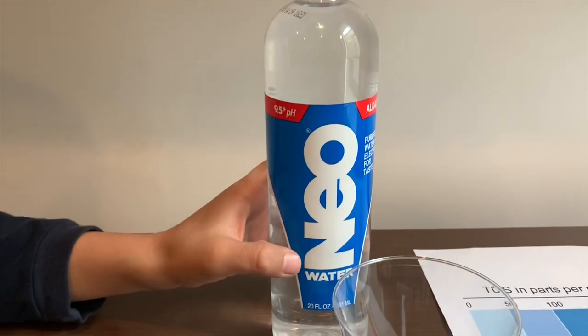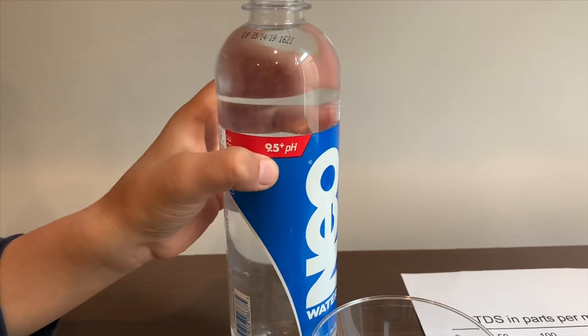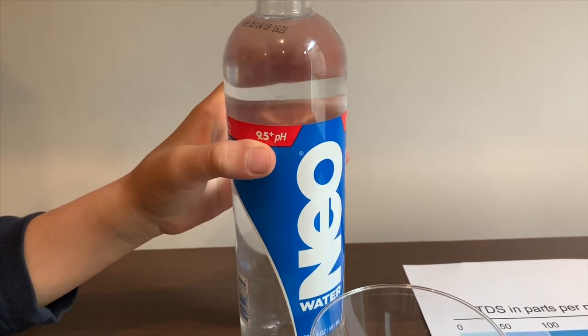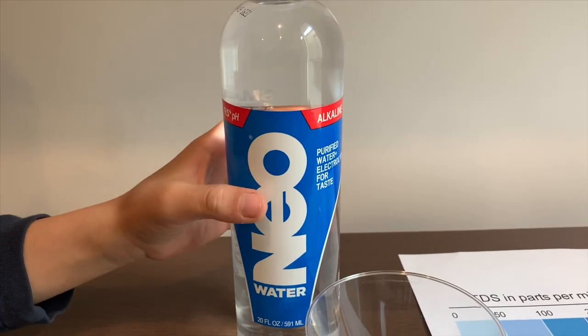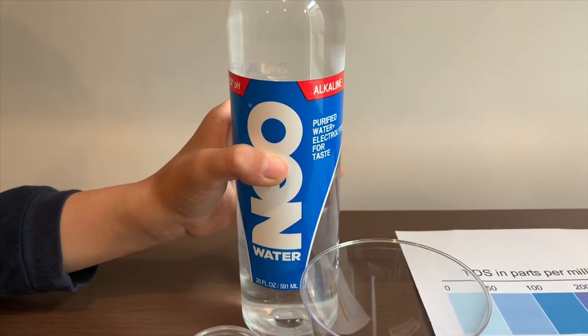This is Neo Purified Water. It says the pH is supposed to be 9.5 or higher. It has electrolytes for taste and it costs $1.59. Let's test the pH and TDS levels.